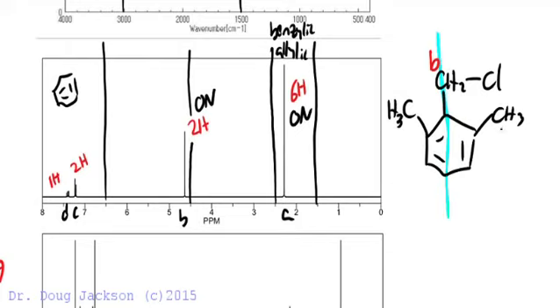So the 2 methyls, there they are. We'll change to red here. A, B is accounted for, and then our aromatic signal C, there's 2 of them, integrates to 2, and then D integrates to 1, and it's a triplet. Okay, very small, couldn't see it, but we don't need that extra information to solve this problem.